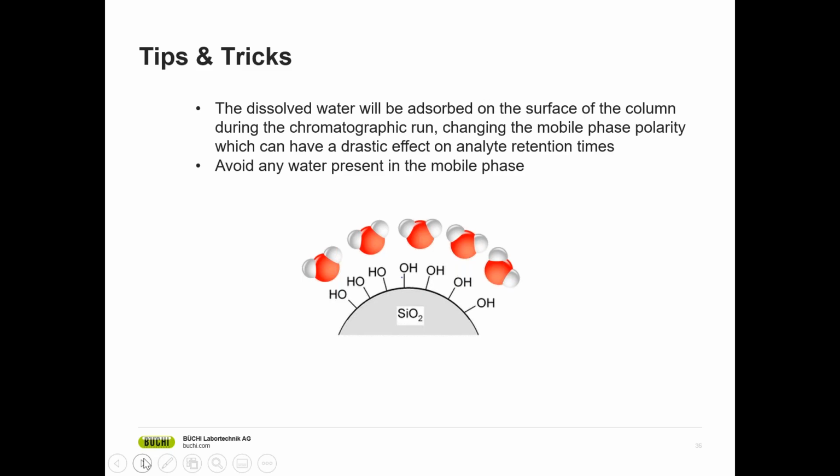So silica gel is often described as absorbing moisture, which may be appropriate when the silica gel's microscopic structure is ignored, as in silica gel packs or other products. However, silica gel removes moisture by adsorption onto the surface of its numerous pores rather than absorbing into the bulk of the gel. If this happens in your flash cartridge, you will have a negative impact on your separation performance. So, important rule, keep your cartridges in a dry place and keep the lids on.